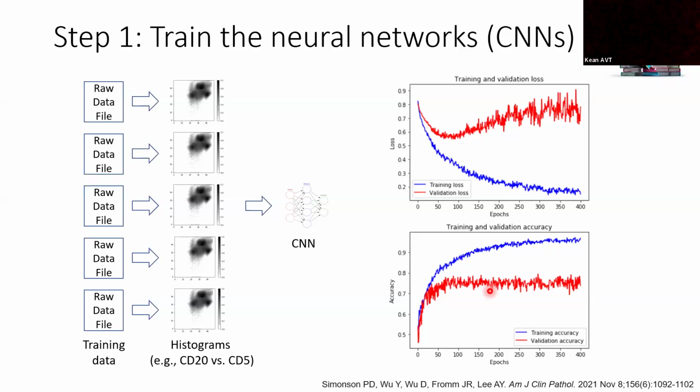And each time, hopefully, it's getting better, tweaking the little internal parameters to be able to recognize positive versus negative. Now, after you train it for too long, it starts to become a little overtrained. So it starts to recognize the training data. It's more like it's memorizing the answers to the test without having the general understanding of how it came to the correct answer. So we cut off the training after about 50 epochs in order to keep it from being overtrained.